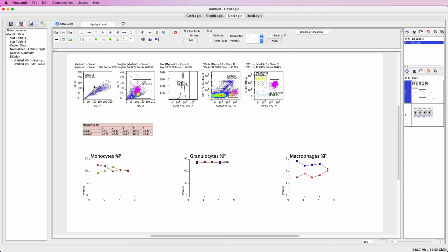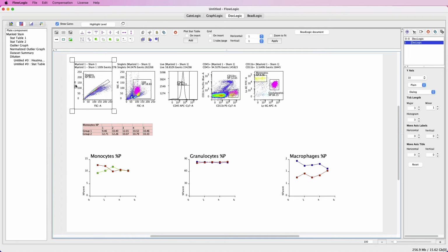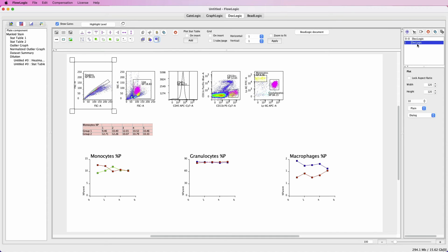So if you click within a dot plot, you can change the plot size and format the gate label text. You can also click on the dot plot labels and titles. So in this case, if I want to remove my title heading and even set the text size to 0 to make it disappear completely, I can now copy these settings and paste it to all dot plots in the selected report.